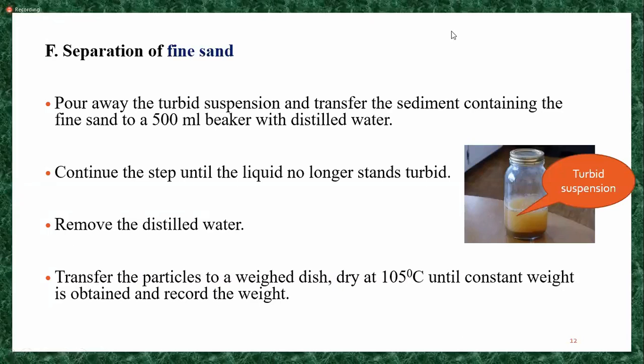Then let's look into the separation of fine sand. Previously we saw the procedure for separation of silt and clay, then the separation of clay. And now let's see the separation of fine sand.